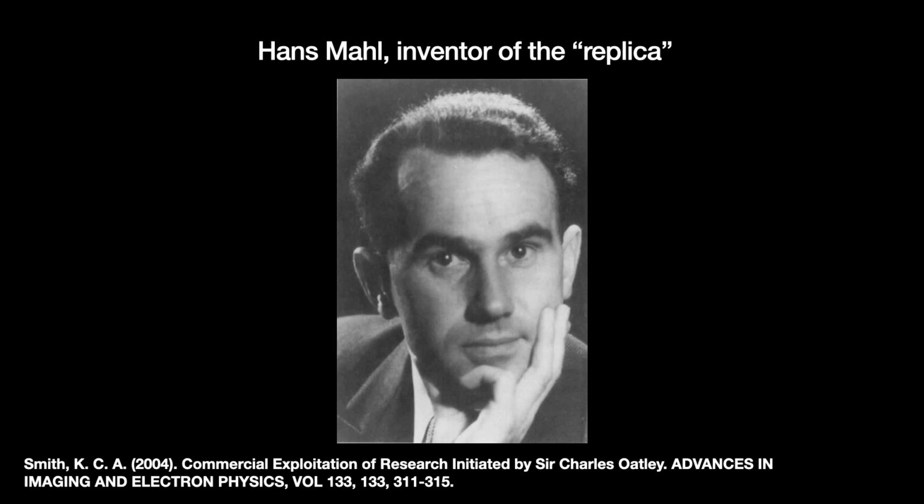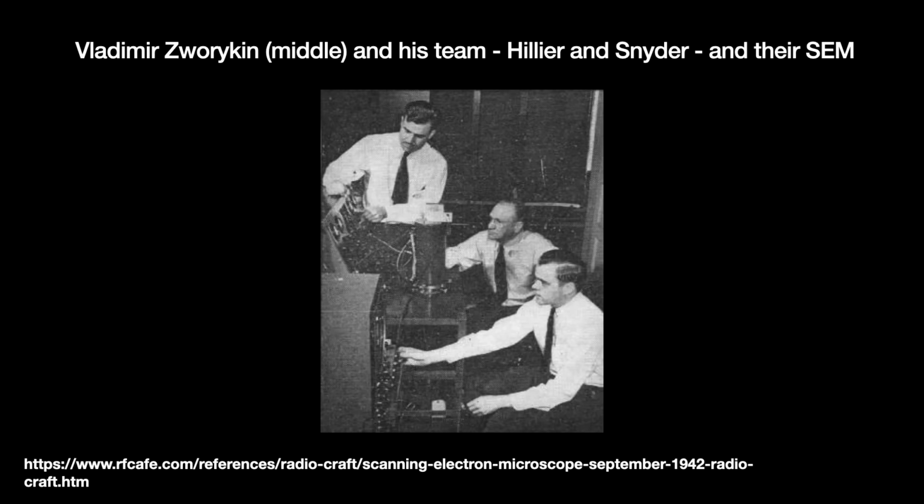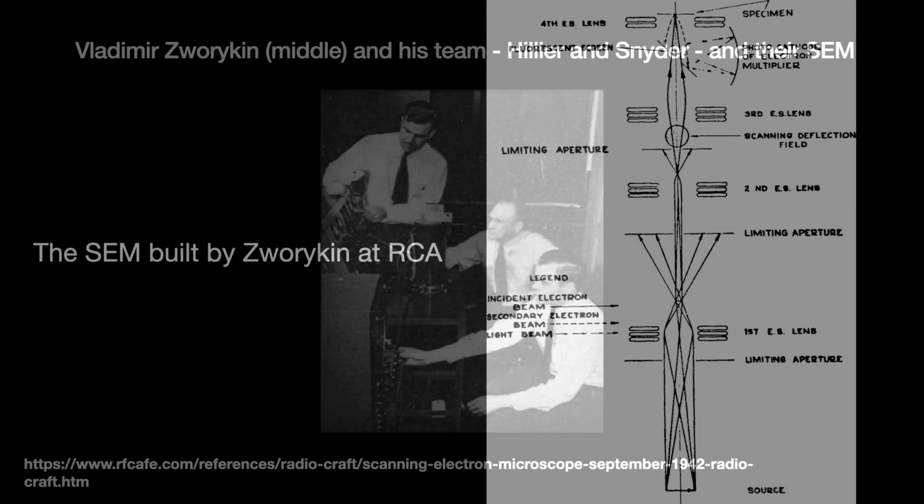They focused on building a machine that can work on samples that we can't cut into thin pieces. In it, a tube generates an electron beam that hits the sample. Electrons then reflect off or are emitted by the sample. Those electrons are accelerated back up through another set of electron lenses and an electron multiplier tube to intensify the image before hitting a detector screen for imaging.